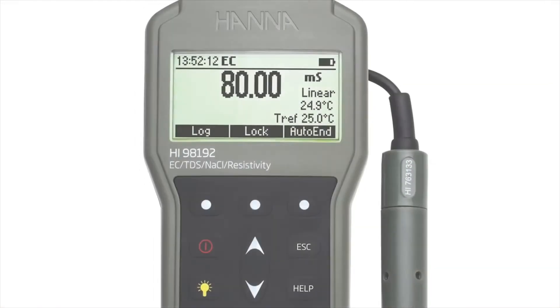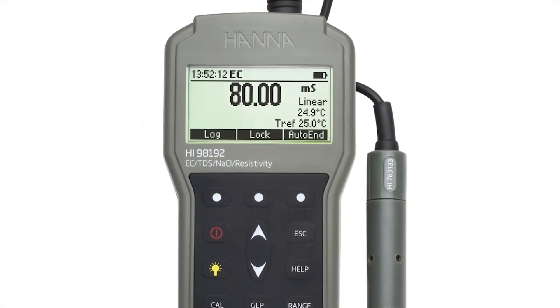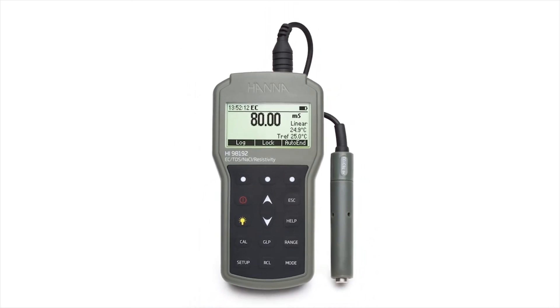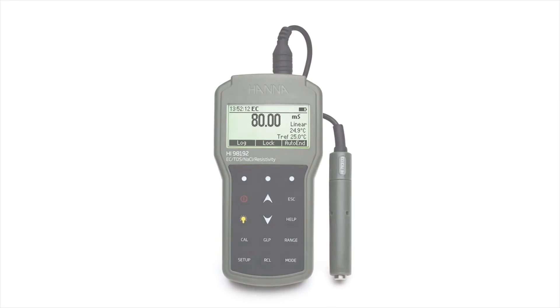The HI-98192 is an excellent choice for the customer who is looking for a rugged, waterproof meter that encompasses the features of benchtop instrumentation with the convenience of a portable meter.